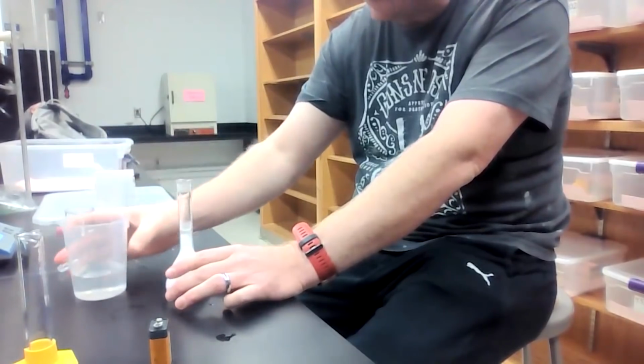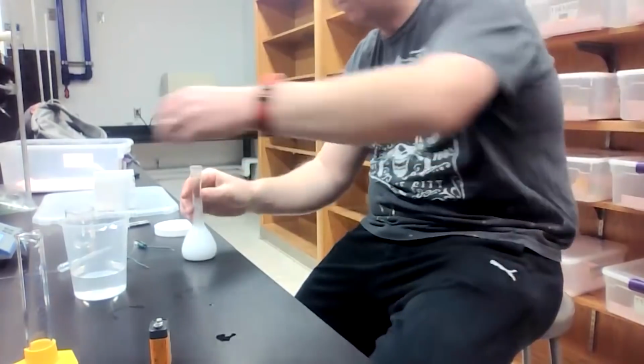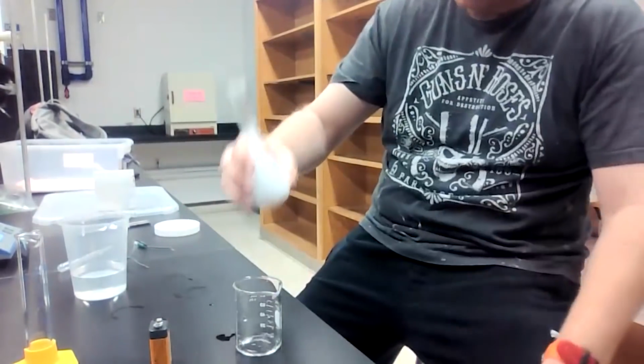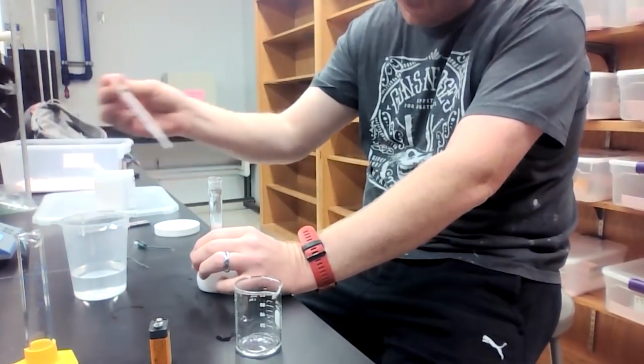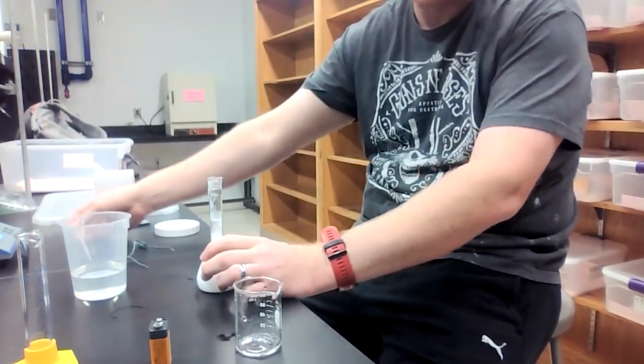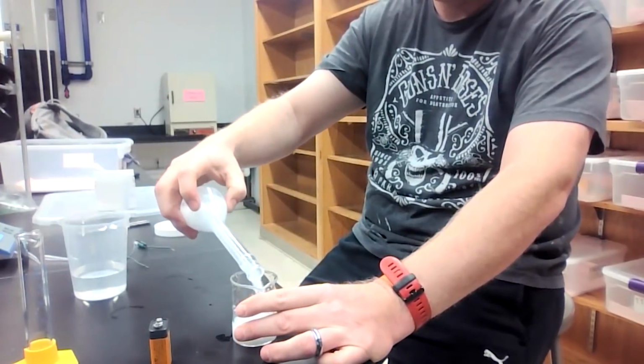Okay, so this is a significantly different solution. This is super chalky and super cloudy. If you were to compare these in terms of going into solution or not, I would argue that this one does not go into solution very well. So I would characterize this as insoluble.